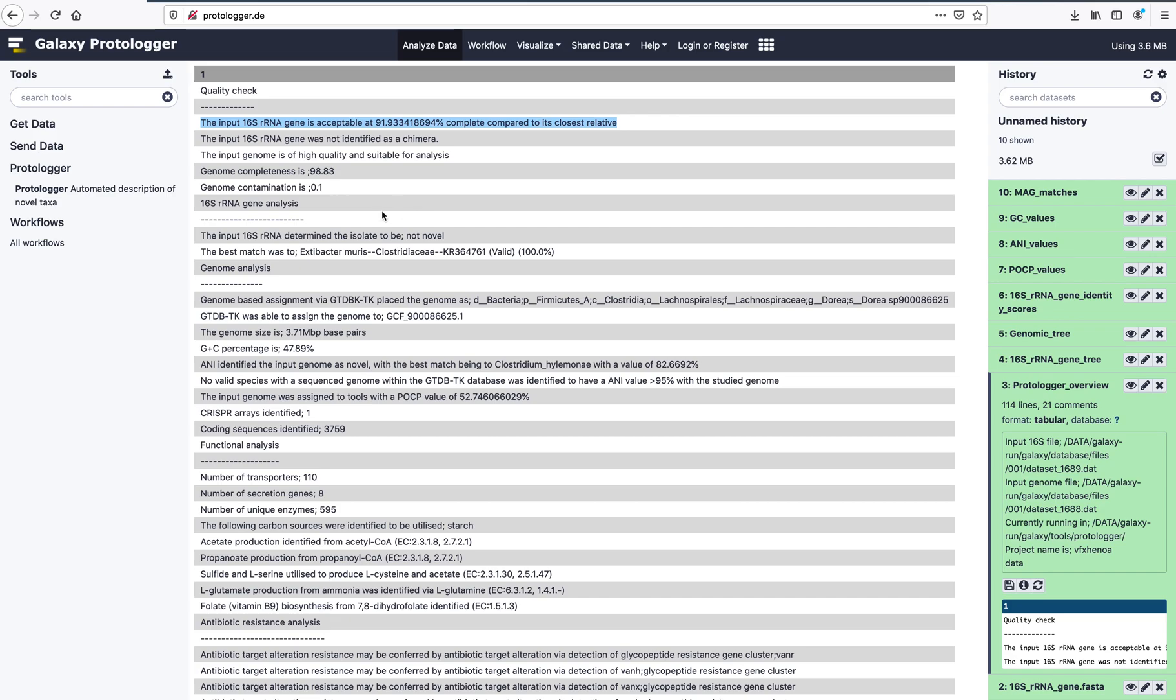Comparison of the 16S rRNA gene to the living tree project indicates that the isolate is not novel. This is highlighted by the best match, which states 100% identity has occurred to the sequence of Extibacter muris.